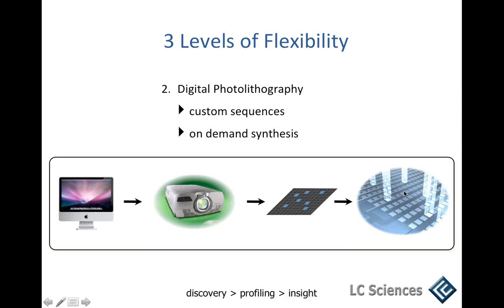Here on the right-hand side, you see the chip, and the lighter columns are symbolizing where the UV light hits the reaction chamber in this particular synthesis step. This is regulated by a mask, which used to be an actual physical mask, but nowadays, of course, a computer combined with a projector system is used for that.